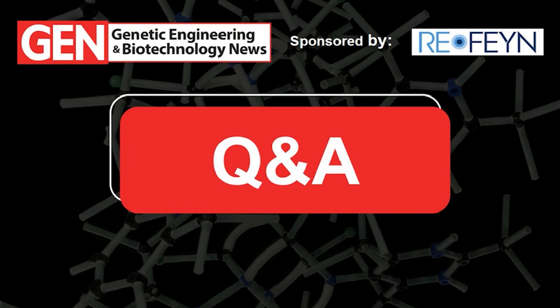Next question we have, you did kind of just cover part of this, but I thought this was an interesting question, maybe something to talk about. Giuseppe would like to know if the machine can discriminate between AAV and contaminant viruses. And I know you said it couldn't measure other viruses because of the mass range, but if there are viruses close in size, would they be able to discriminate?